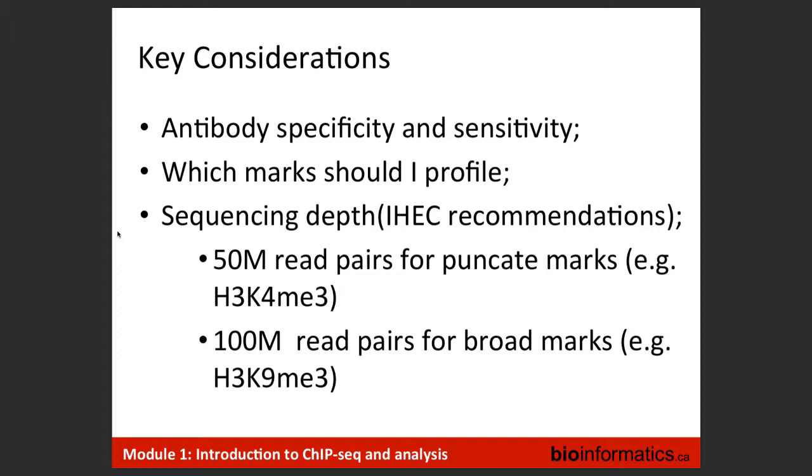I can say for our own group here in Vancouver, we spend more money and time validating antibodies than we do purchasing them. So just to give you an idea, there are a number of antibodies out there that are commercially available that do not pass just a standard validation of what's the specificity, what's the sensitivity. So if you're going to start an experimental design where you're using ChIP sequencing, please spend the time to understand the specificity of the antibody. I'm going to go through that in a little bit more detail.